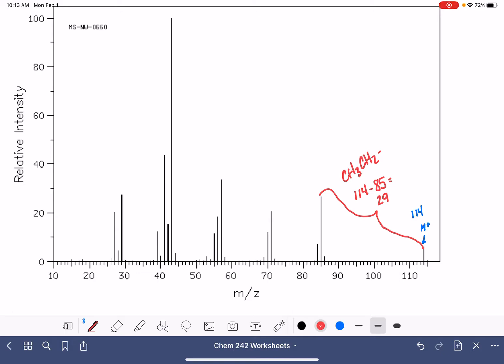We also have another gap right here. So this gap corresponds to 85 minus 71. That is a 14. That corresponds to a CH2 group. None of this is really that surprising because we expect to have those types of groups present in our molecule.